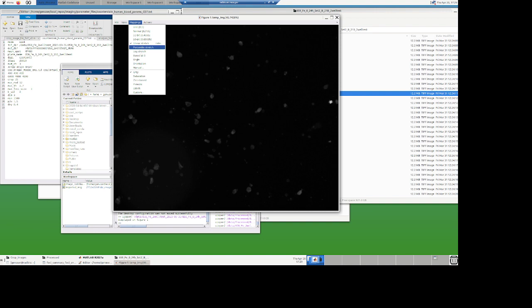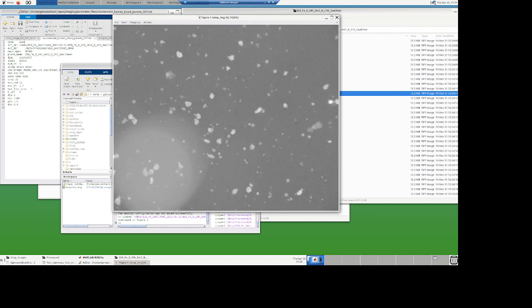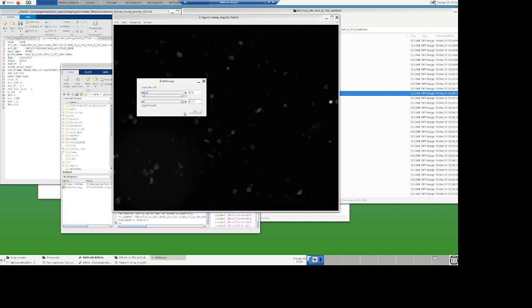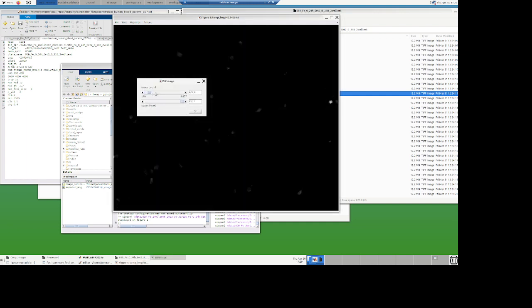You can do a log stretch if you want. And we can see that blob again, not too good. I like linear stretch. You can go with a manual stretch and set the minimum. Maybe not so low. But the bottom line is, those numbers you see here on the right, 400 and 6,000, define the range, so that when we do a projection, I want to be able to compare all my thumbnails with each other.